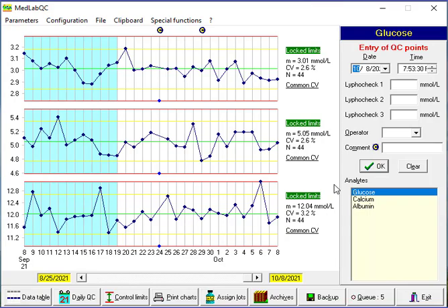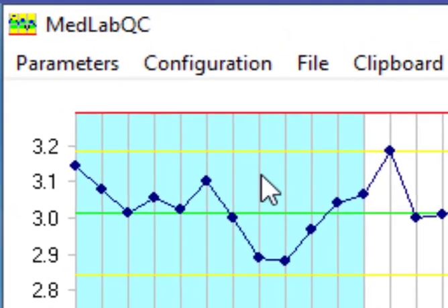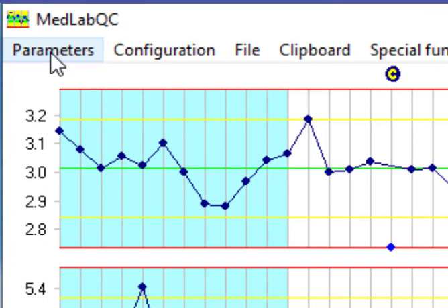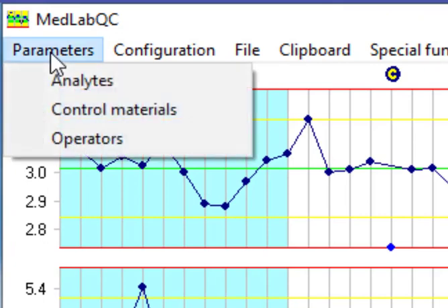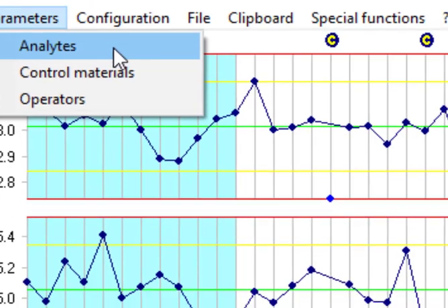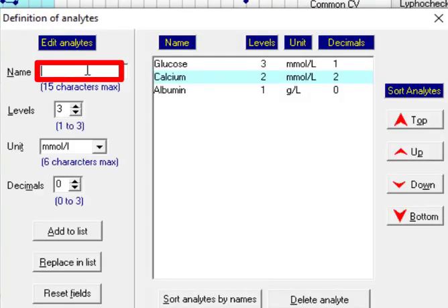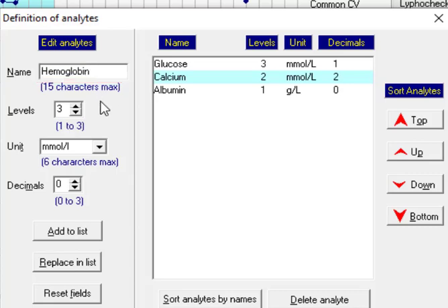For this session I want to define a new analyte. We go to parameters and analyte. In this field we can define a new analyte, for example I want to define hemoglobin.